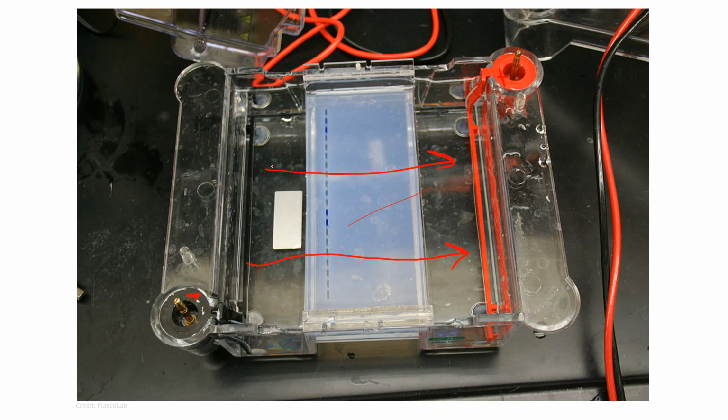You can see there's DNA dispensed in these wells. As the electrical current passes through the gel, it will pull the DNA across. This happens because DNA is negatively charged because of its sugar-phosphate backbone. Phosphate has negative charges on it, so all in all there's a slight negative charge on molecules of DNA.